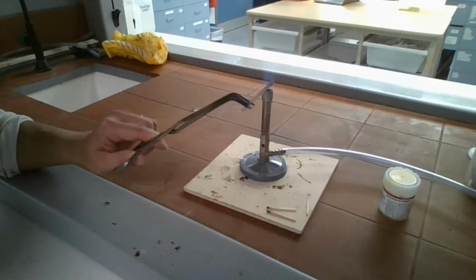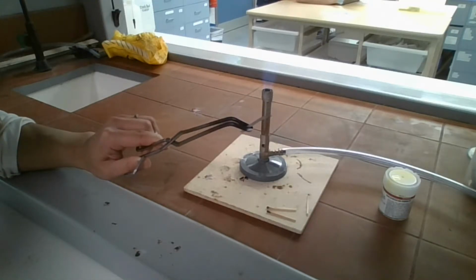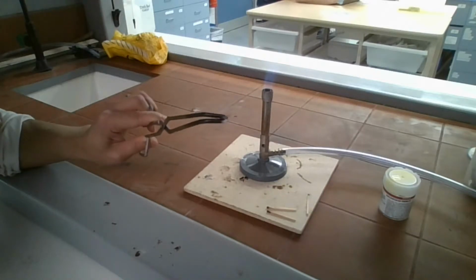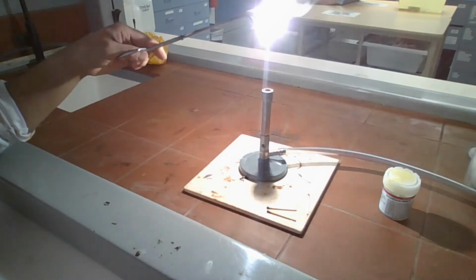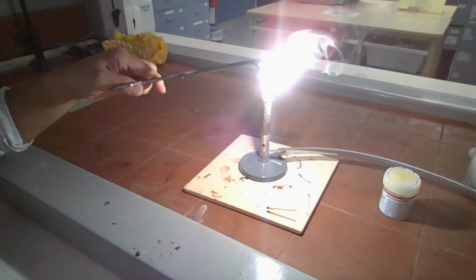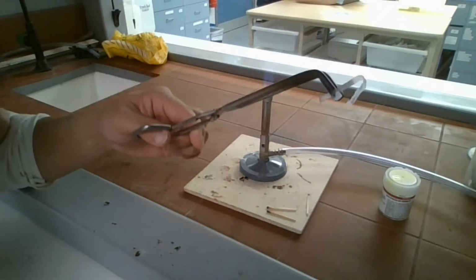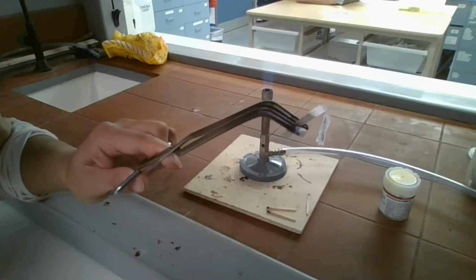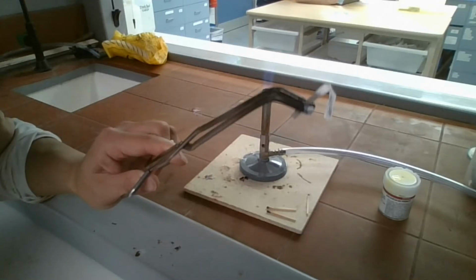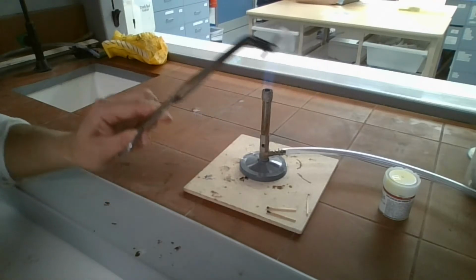Now I've got a magnesium piece here. And if you read the task sheet, it said it had a metallic luster, but then if it was burnt over a Bunsen burner, it produced a bright light. And once it's done, it left the white powder. Yeah, it is a bit crumbly, and it will crumble if I touch it. It's got some unburned part, but the reaction has occurred with a lot of light coming off.